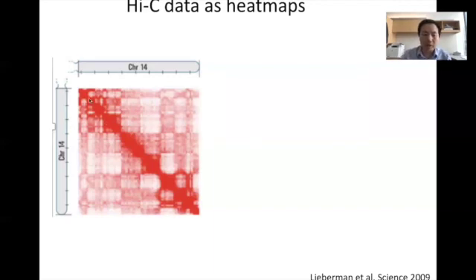What they are showing here is the chromatin interaction for the whole chromosome 14, right? So immediately you can begin to see there are clear patterns, right? A lot of the data analysis pipelines or algorithms are really trying to dissect the Hi-C data matrix and look for patterns, right? So this is one way to represent the Hi-C matrix, as a square, but sometimes you can also see a triangle-like shape. So what did it do, right?